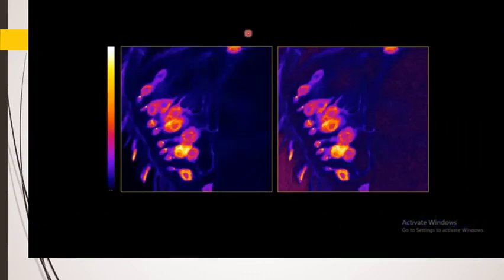Simply, in an image, if we increase the gain, it would increase the signal, but at the same time you see the image looks more grainy because the background signals also increase while we increase the gain.